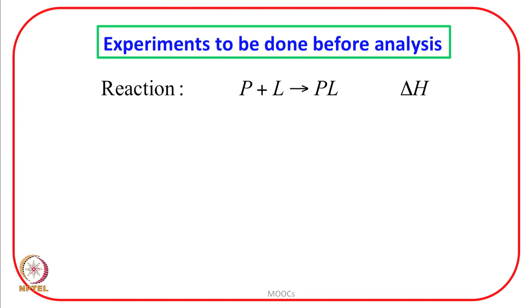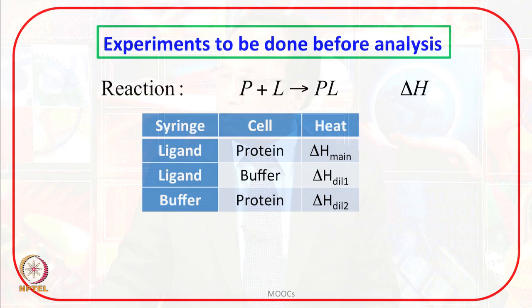Therefore, heats of dilution must be determined and corrected. For a complete experiment, before the analysis of the data is done, the following should be done.